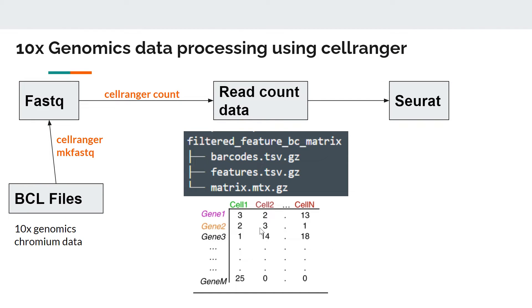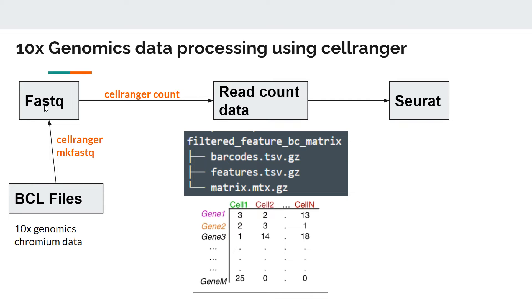Here is an overview of the Cell Ranger workflow. After sequencing on Illumina, we get a BCL file — the raw file. In the first step, we need to convert these raw files to FASTQ format. Cell Ranger provides a tool called mkfastq which can be used to convert BCL files to FASTQ. We can also use Illumina's built-in bcl2fastq tool. Either way, we must first convert the BCL files to FASTQ format.